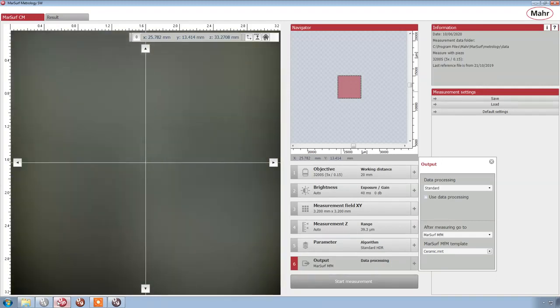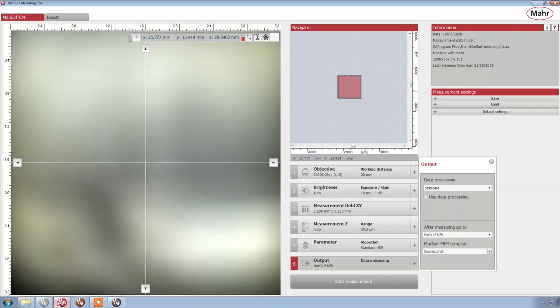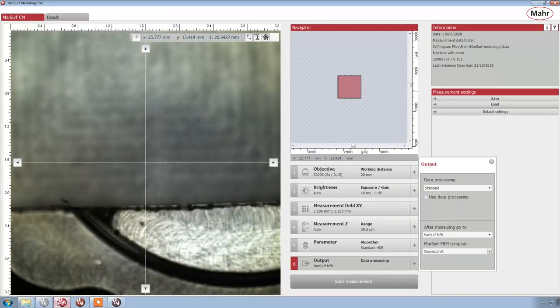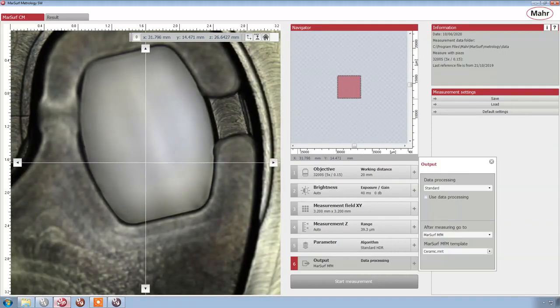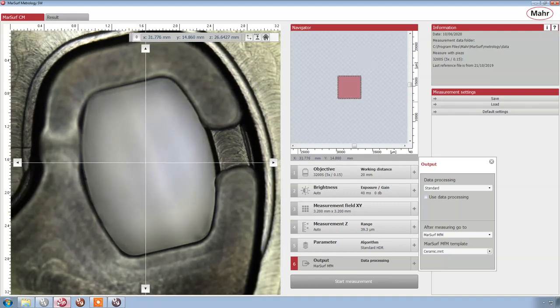With this part, it's a transparent plastic, injection molded part. It's something I'm always asked: can you measure polymers? Can you measure plastics? Okay, but can you measure clear plastics? And I always answer a bit flippantly, yeah, of course, obviously we can do that. I guess it's just because the tool does it so well, I don't realize that it can be problematic.